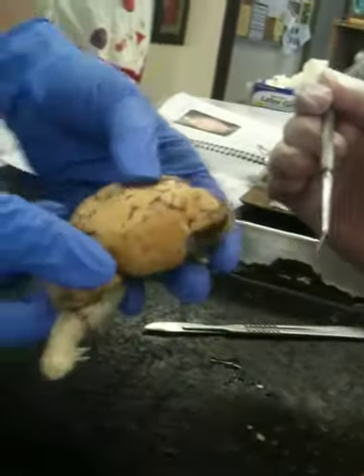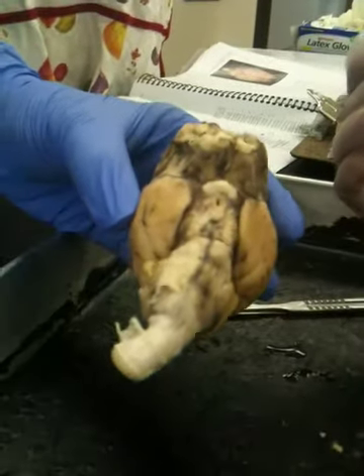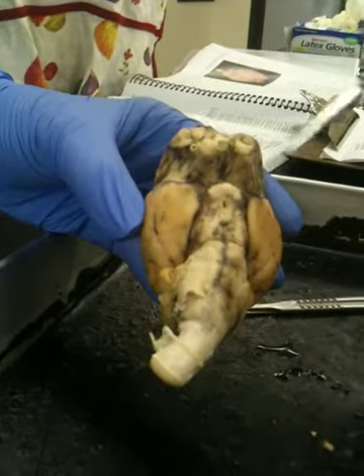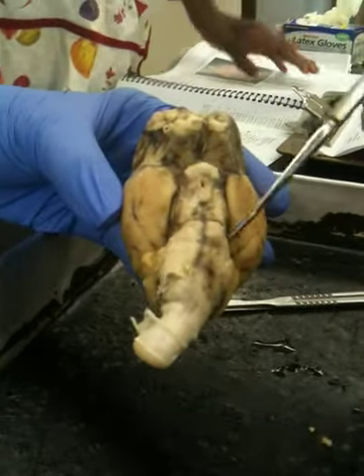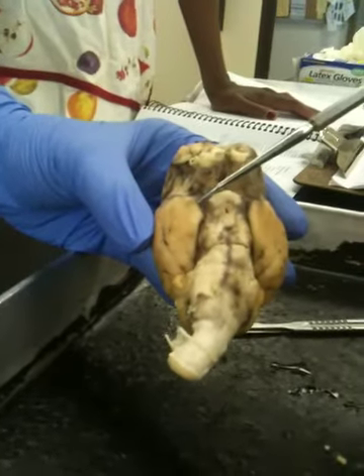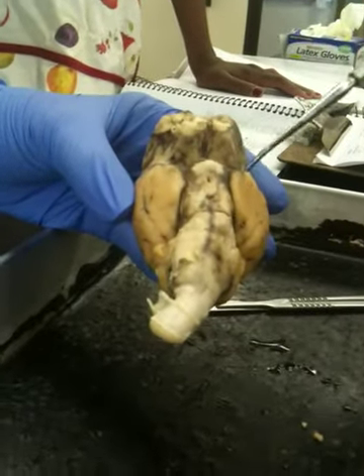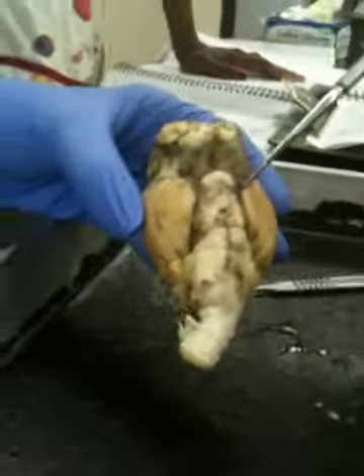The diencephalon, if we flip it over here, if you'd be so kind as to circle around the diencephalon area, that would be very helpful. Thank you very much. We have the optic chiasma, which is somewhere around here. Oh, we have to cut for that.